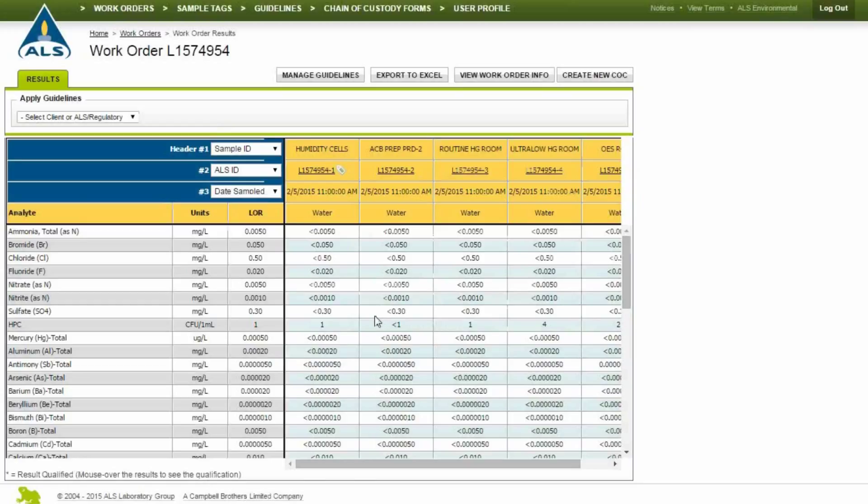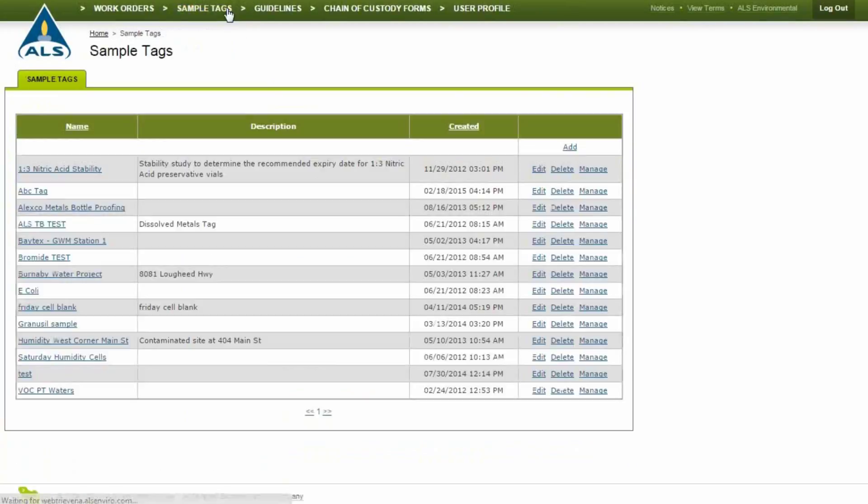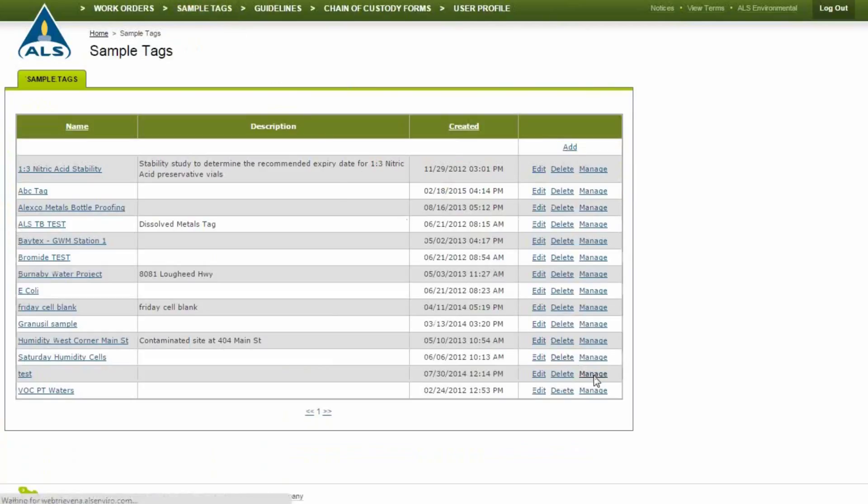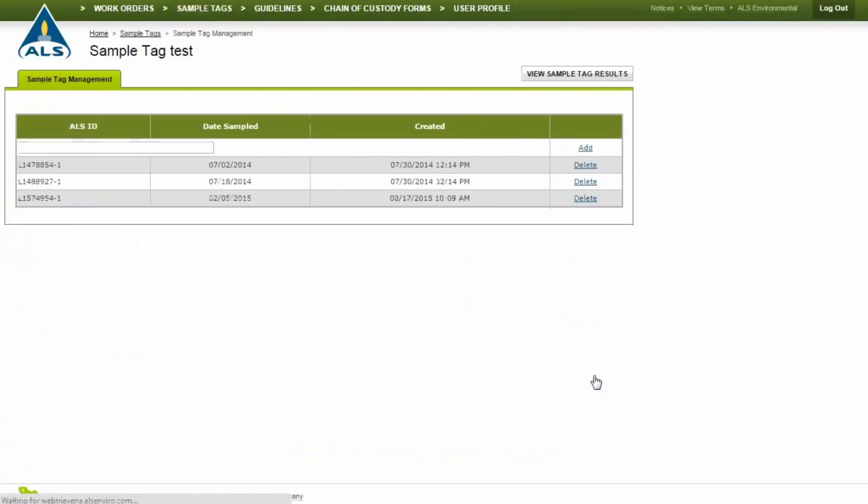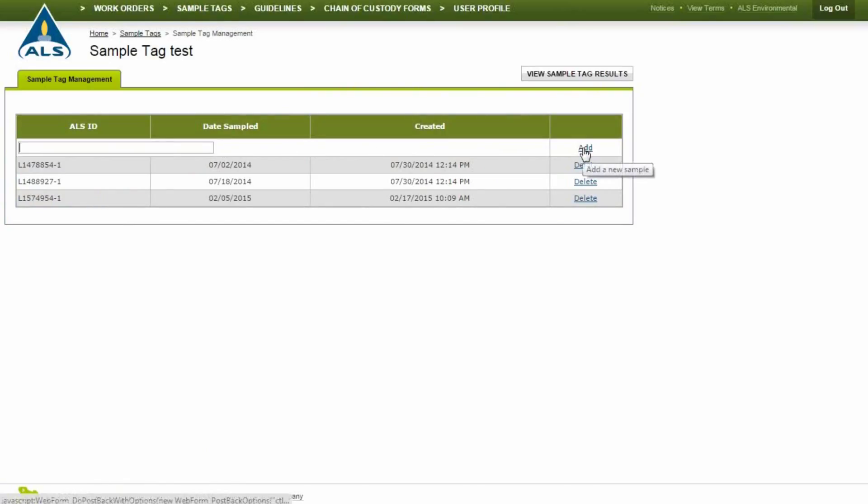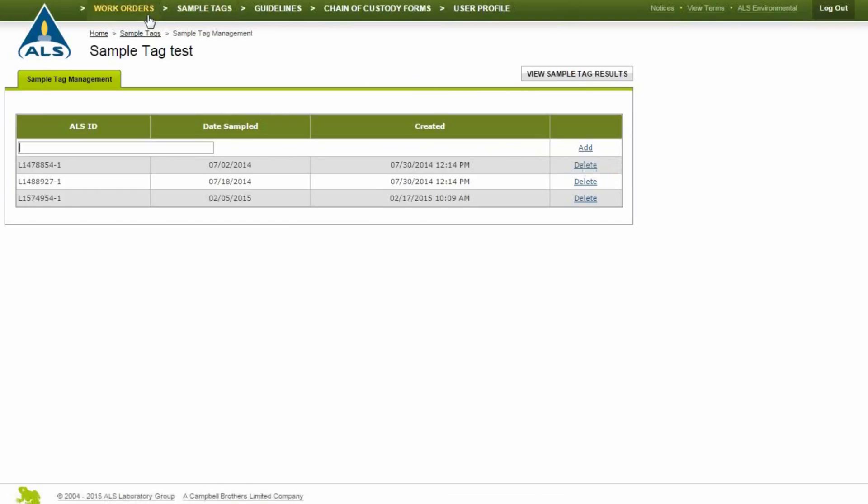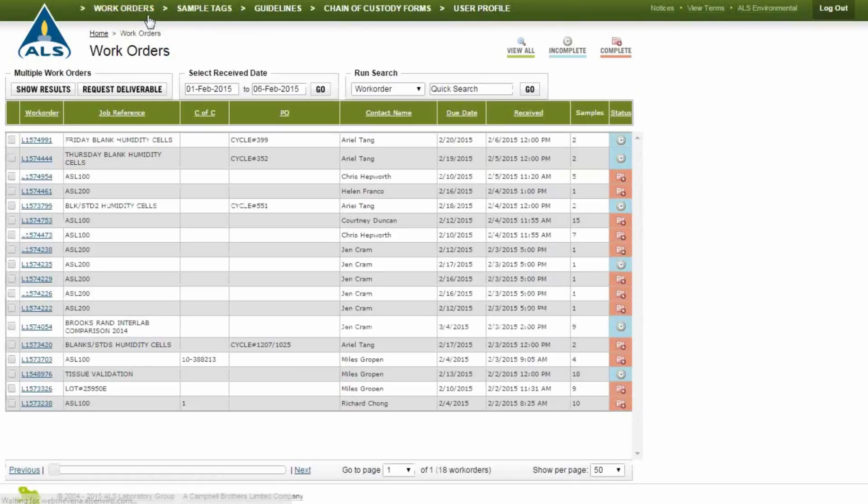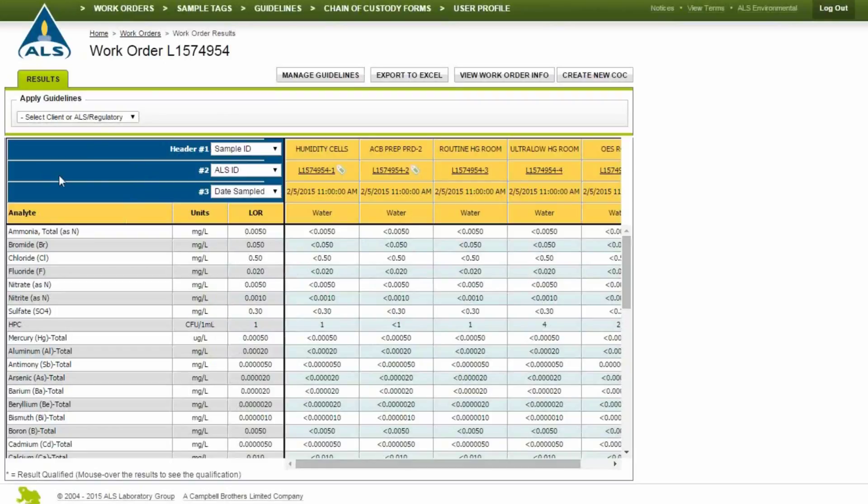Sample tags can also be added by clicking Sample Tags in the top links. Click Manage, add ALS Sample Number and click Add. When the sample has been tagged, a luggage tag icon will appear next to the ALS Sample ID.